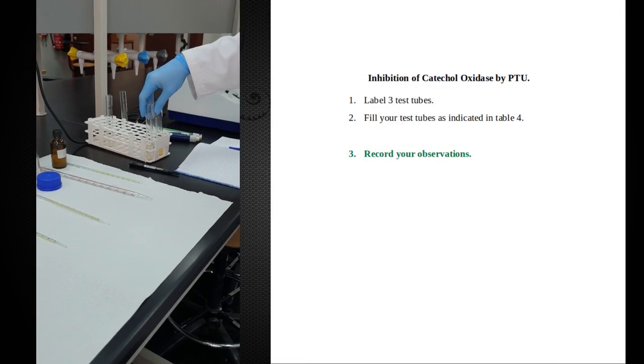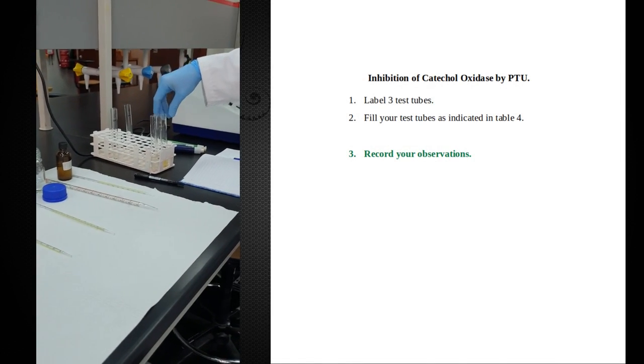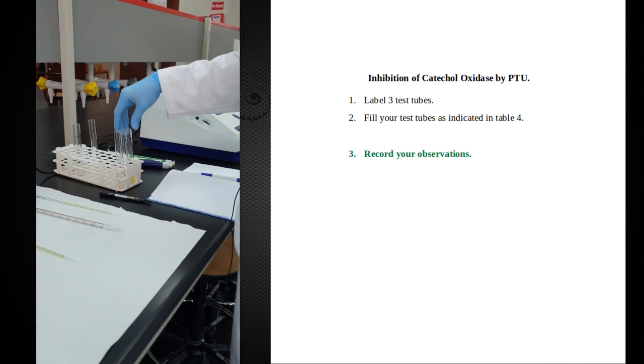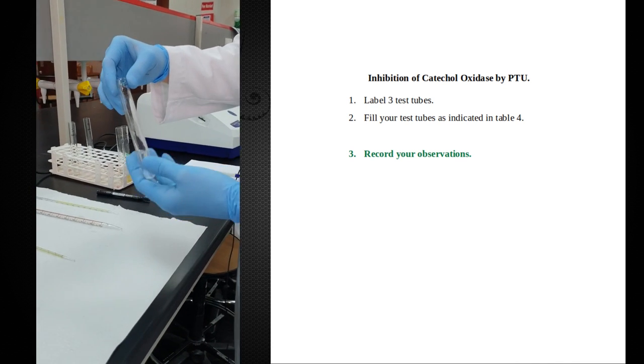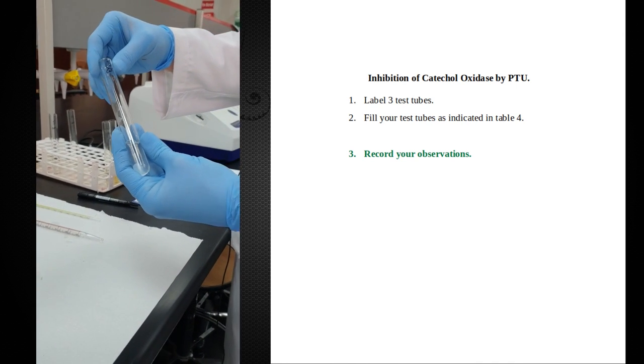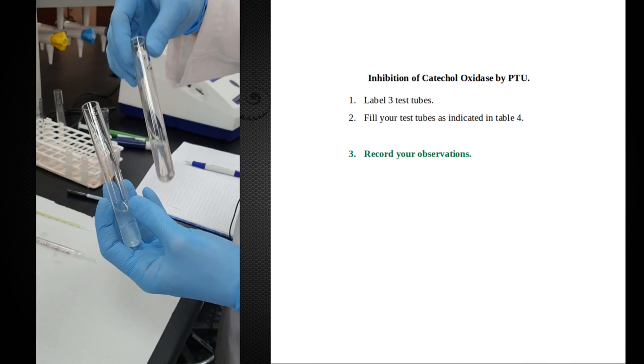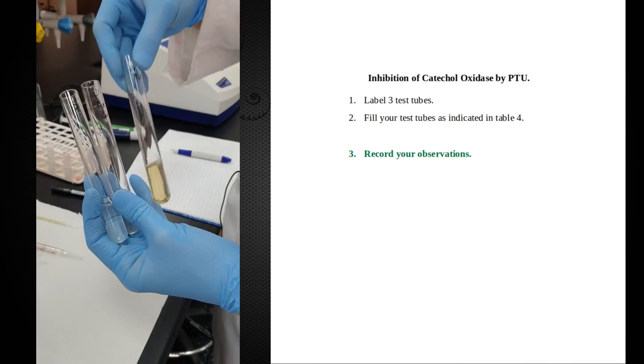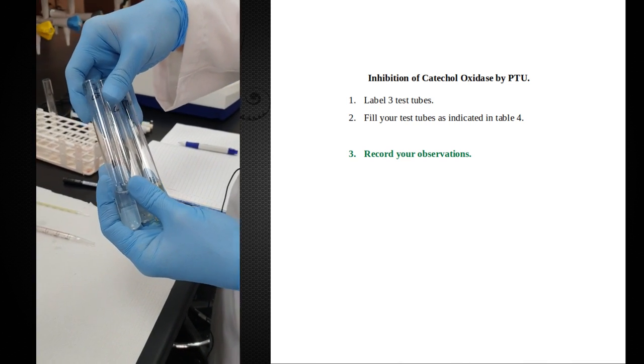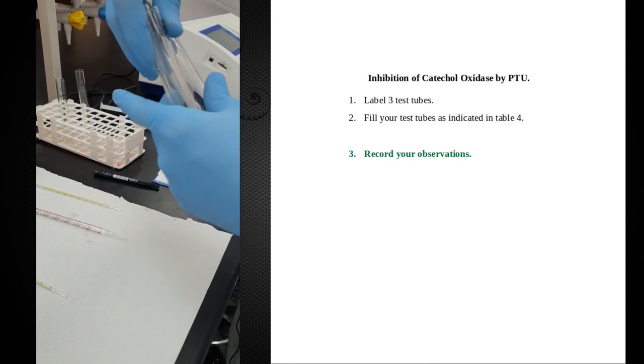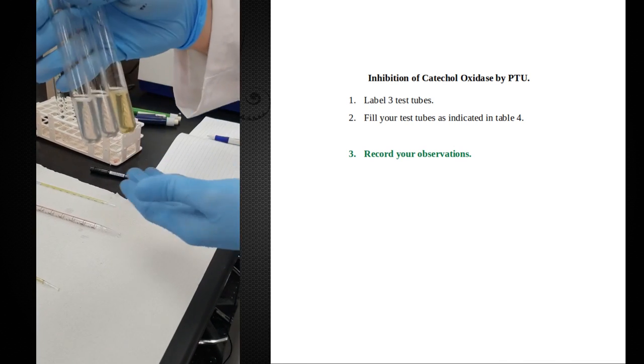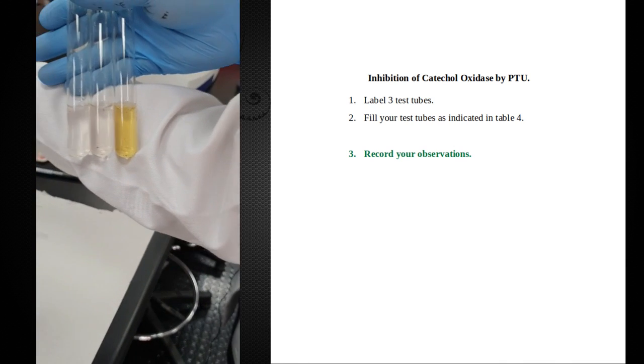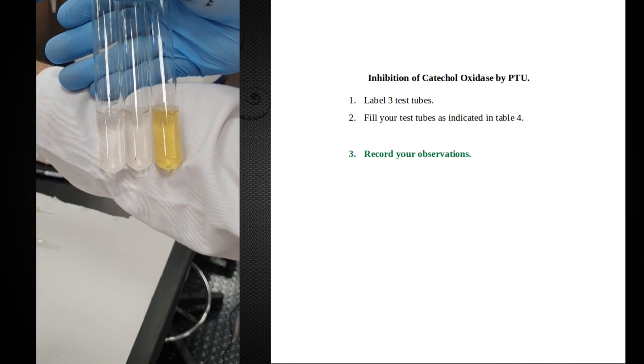Our results from the experiment with the inhibitor. We have our three test tubes. We have one with just half a milliliter of catechol, one with twice the amount of catechol, and one tube that did not get any PTU with just half a milliliter of catechol. First things first - let's notice that tube number three has a lot of color development.